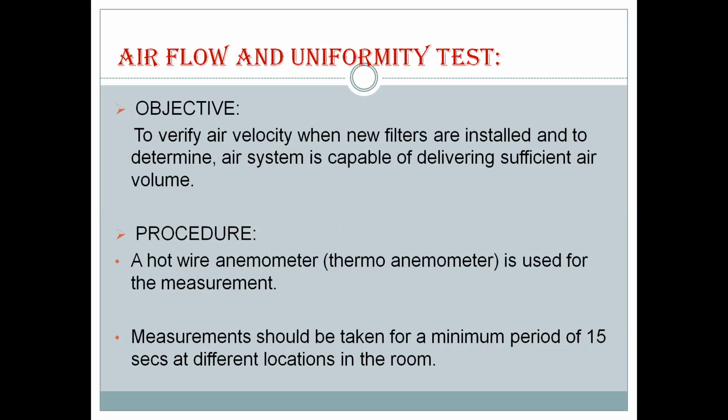Then airflow and uniformity test. The main objective of the airflow and uniformity test is to verify air velocity when new filters are installed, and also to determine whether the air system is capable of delivering sufficient air volume or not.